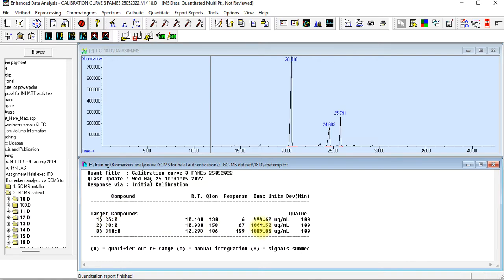So you don't have to manually calculate using this software. You can trust it. It is based on the calibration. Yeah, the one. So now, is it easier for us to copy and paste this data into our thesis? No, no. You can export to Excel as well.